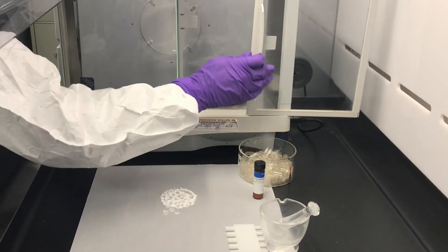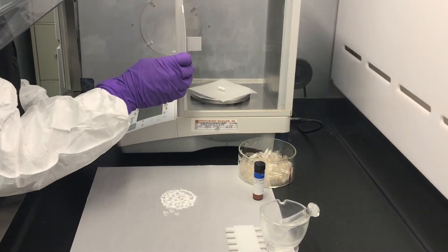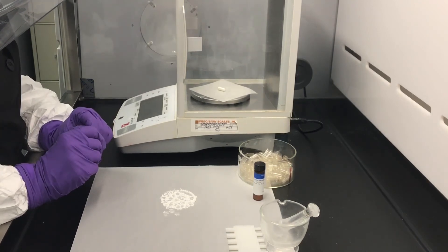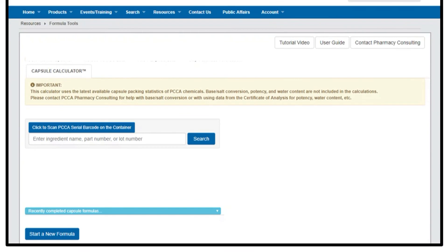To verify consistency of technique, repeat the process three times. Calculate the average of the three to get your final pack stat. Did you know we have developed a cool online capsule calculator tool to assist in calculating capsule formulations when using a PCCA chemical? You can check it out on the members-only website.